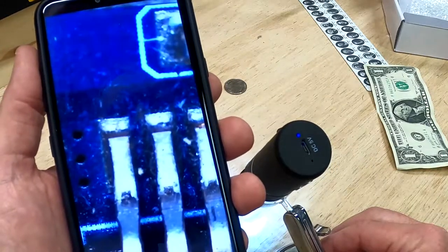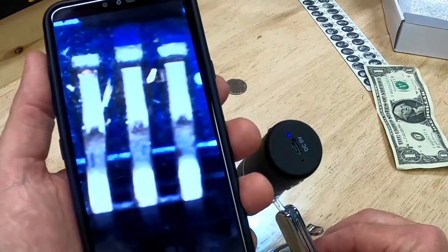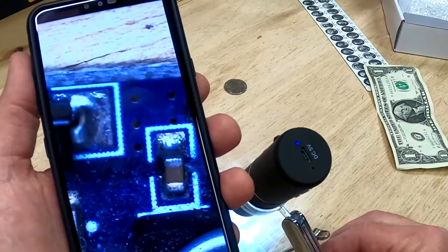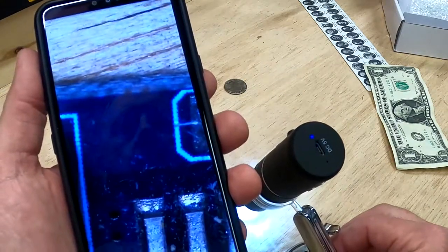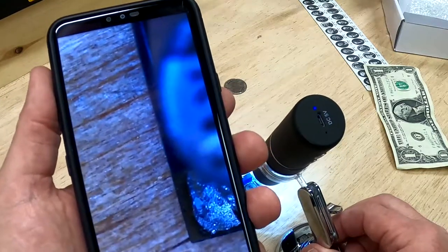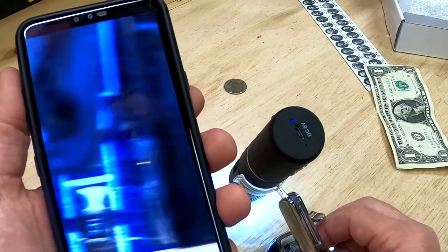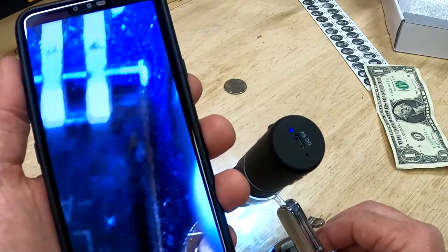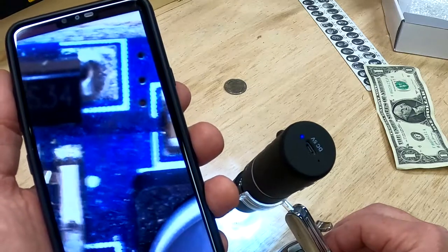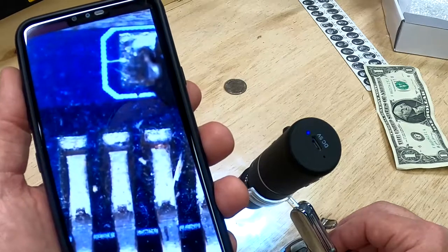Here's a little circuit board I use for some of my projects. You can even see the debris in between the leads on that microchip — that's really cool. This thing does a really good job. I was apprehensive when I bought it, but it got tons of great reviews on Amazon and I've been very impressed with the magnification and how well it focuses.